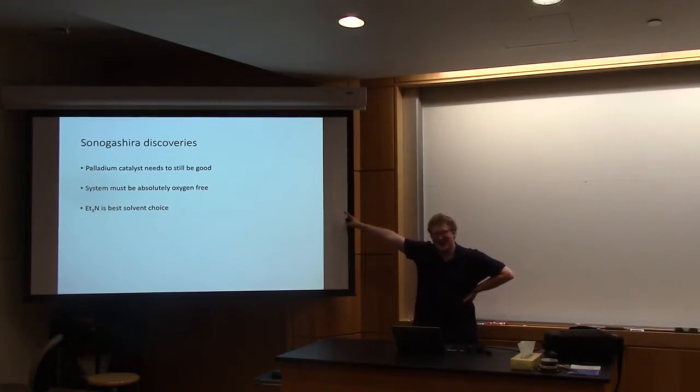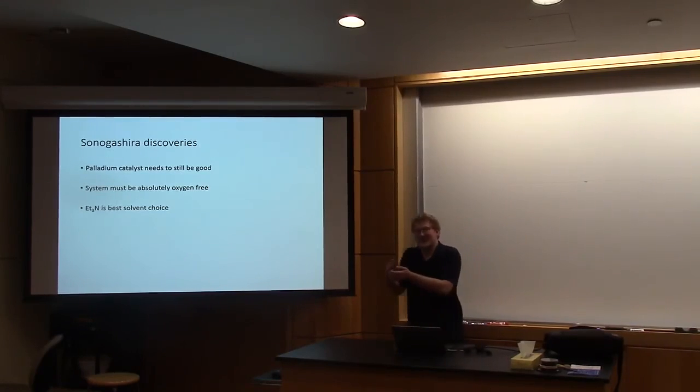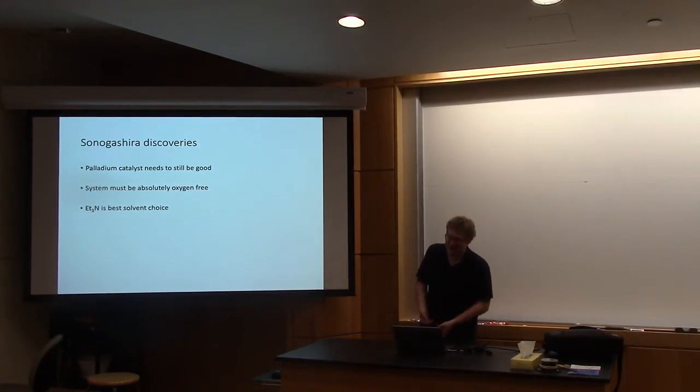You need to actually make sure that your catalyst is still good. The first catalyst that I tried to work with was just the dregs of this little bottle that had probably been opened a long time ago, and unbeknownst to me at the time, it was pretty much entirely oxidized, so it didn't work. The reaction never progressed. So ultimately, when I got my hands on one that did work, I was able to successfully complete the reaction.